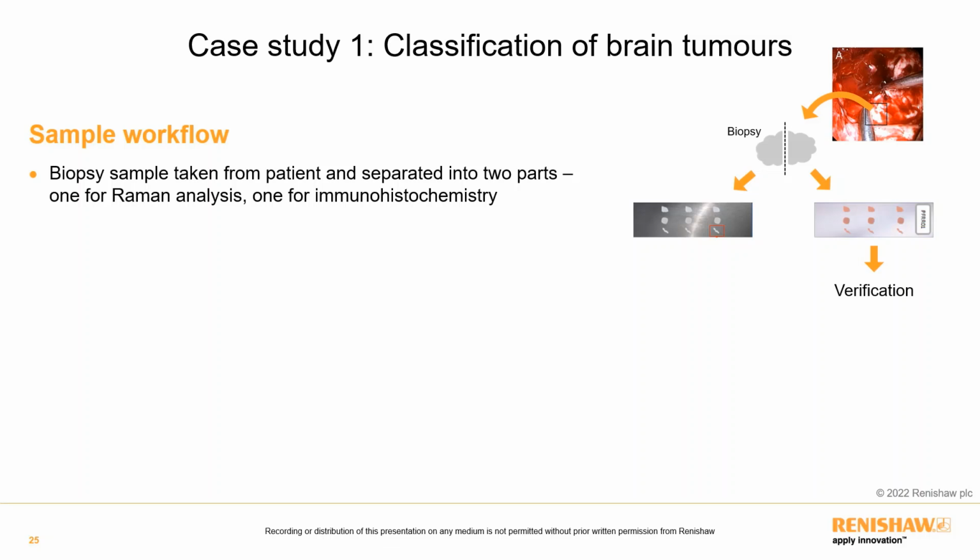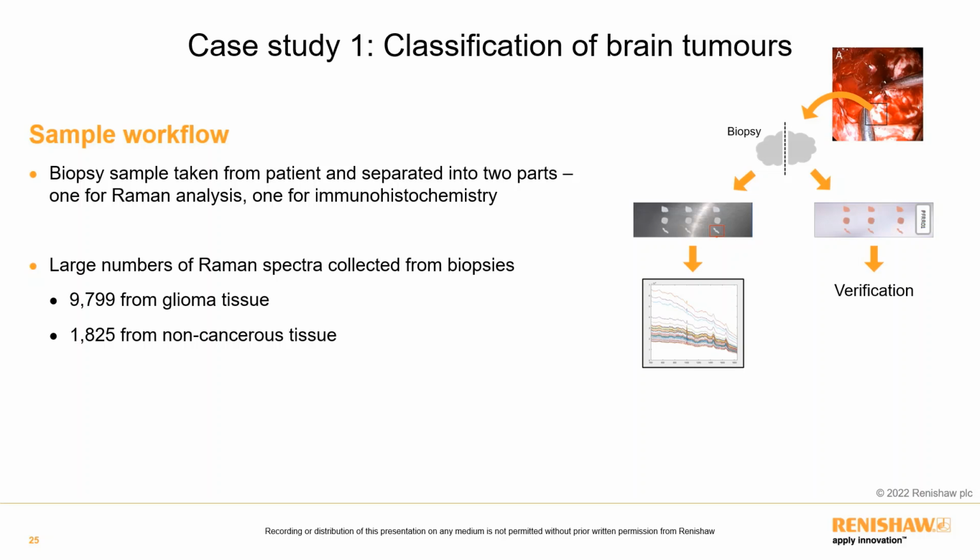The first part was mounted on a mirrored stainless steel slide and underwent Raman analysis, whilst immunohistochemistry was performed on the second part to verify the generated Raman data. Raman spectra were collected using a Renishaw biological analyser, which was stationed within the clinical laboratory.